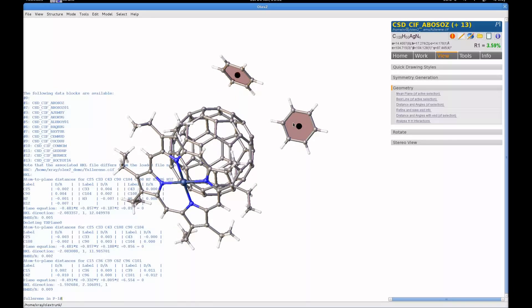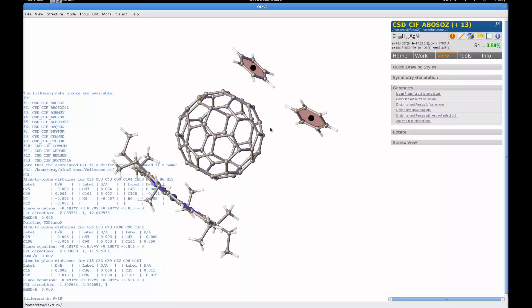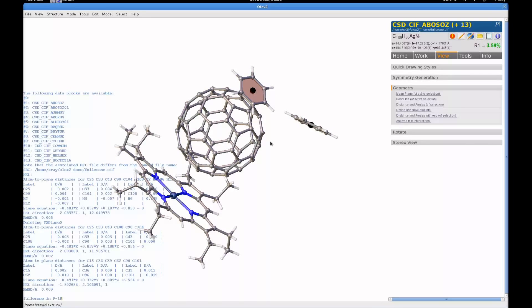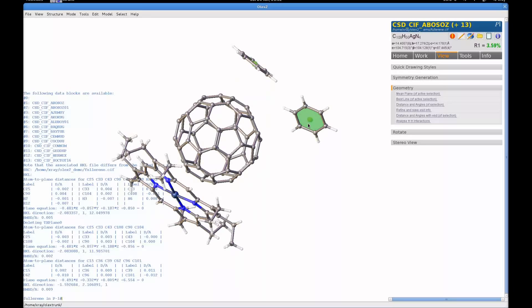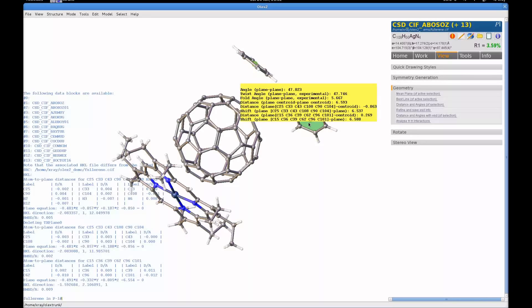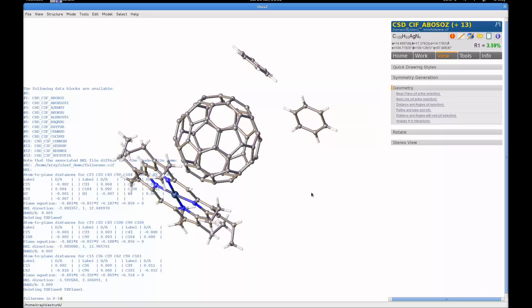Obviously you can tell in this structure that you might want to do more than one or two mean planes on six-membered rings. But Olex2 caters for that straight out of the box. Let's get rid of these rings and just tell Olex2 to do an mplan, which is the mean plane command. It's the same command that's being told by the GUI up here on the right.